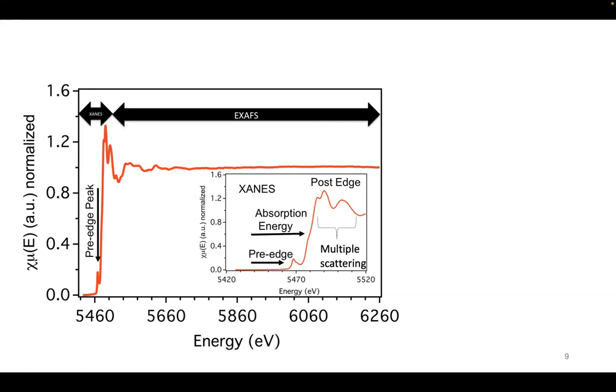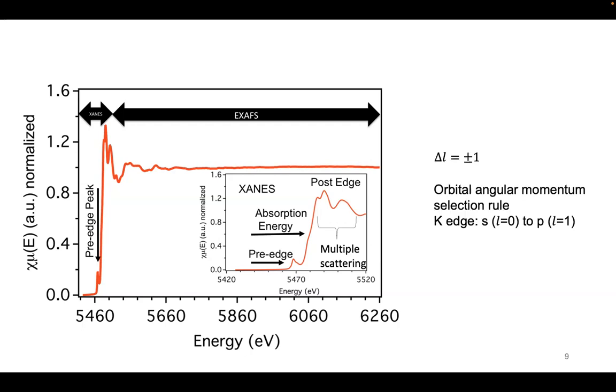So before you transform this normalized spectrum, we can get information about the fine structure itself. But since this is spectroscopy, we are confined to the physical rules of chemistry and physics.